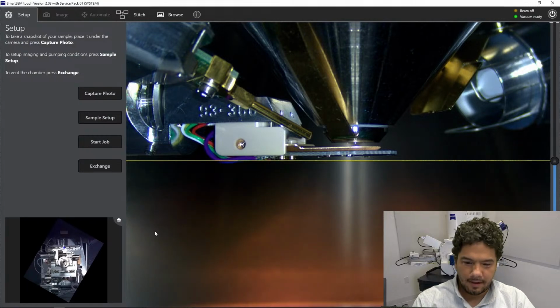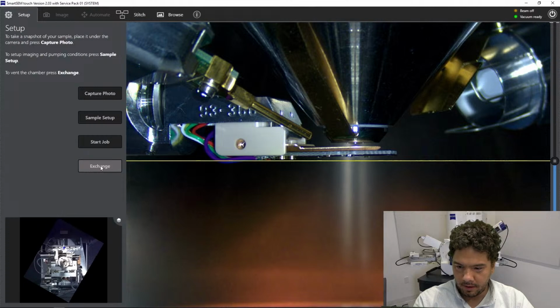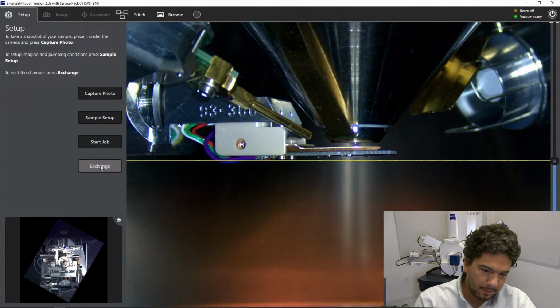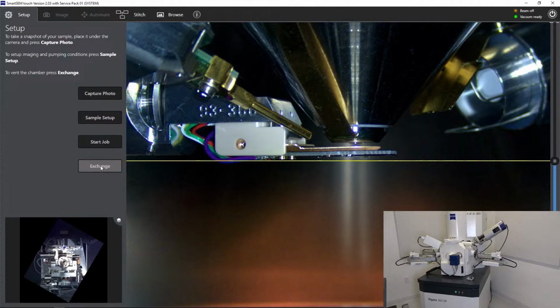Okay, thank you, Chris. I come back here. Let me disappear for a moment because it's important that you see this part that is behind me. Now, let's see a little bit more detail about all this short explanation that Chris gave us some minutes ago.